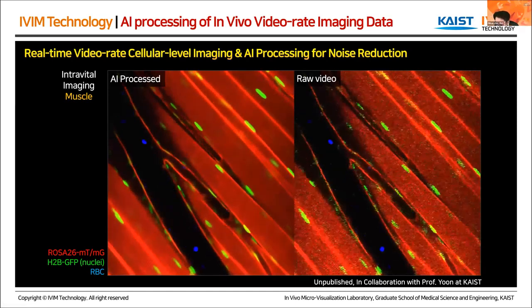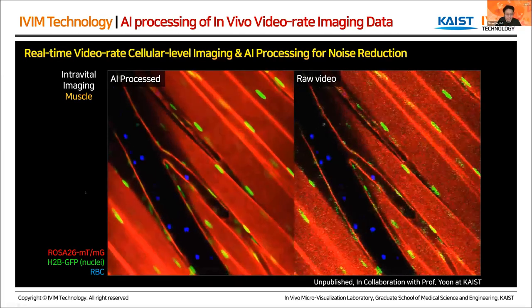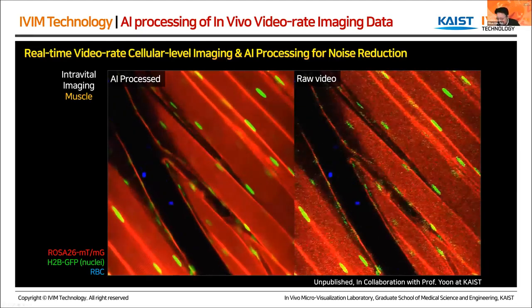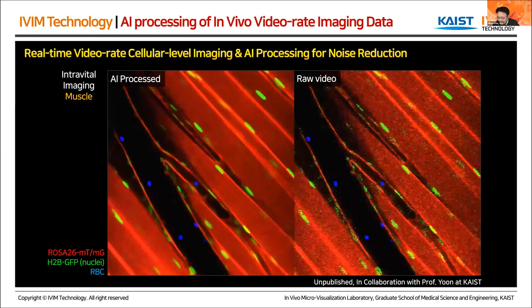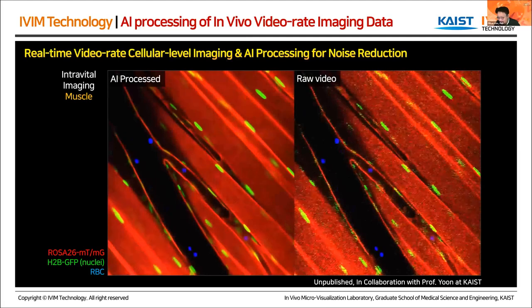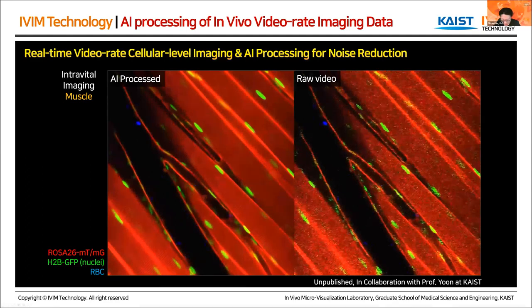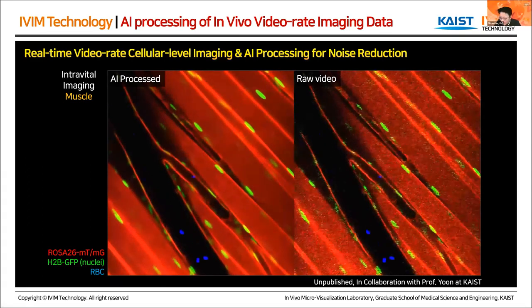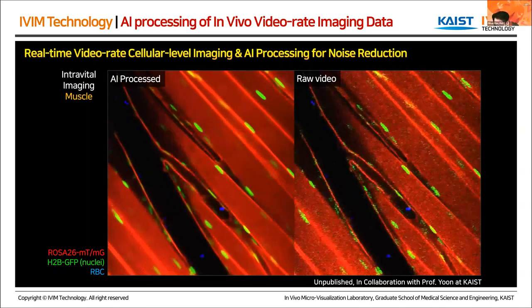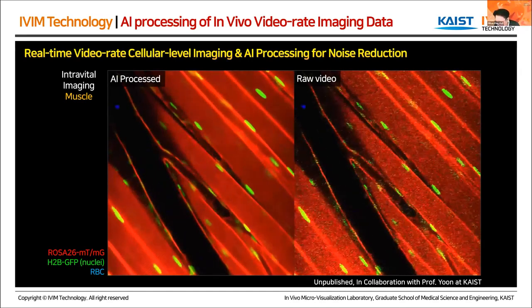The next question is, can you image an awake mouse in this setup? In our standard model, it's difficult. But as I told you, we have a pre-space system, and using that custom system we can image the awake mouse. We actually provided that customizable system for neuroscientists before. So the answer is yes, but we need a custom-designed system for awake mouse imaging.